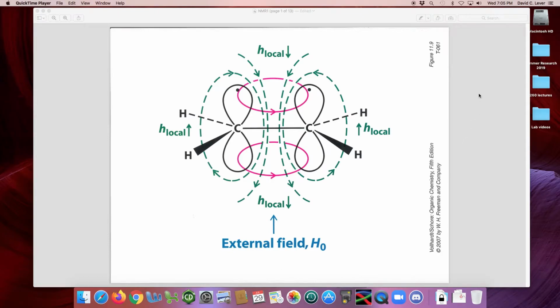So we've seen a lot of NMR theory, but you really won't be able to be good at NMR until you start seeing some examples. And mostly what you're going to want to be doing is taking a spectrum and getting from it a structure rather than the other way around.